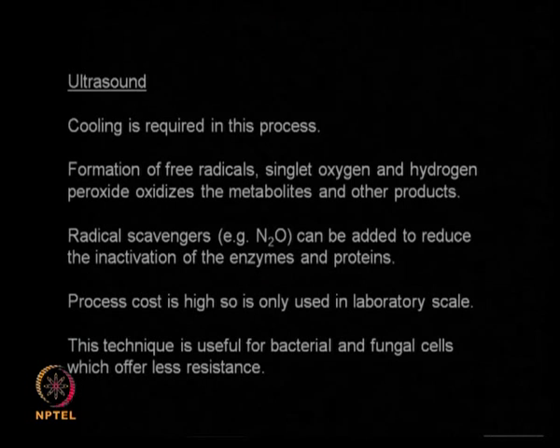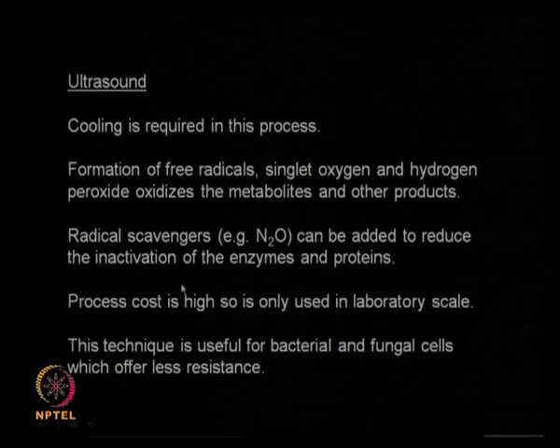You need to be very careful about it, because ultrasound produces radicals. So you need to add radical scavengers, for example N2O. By adding radical scavengers, the radicals generated by the ultrasound treatment can be captured, but then the problem is how do you remove the radical scavengers after you do your cell breakage. That is an issue which you need to keep in mind.